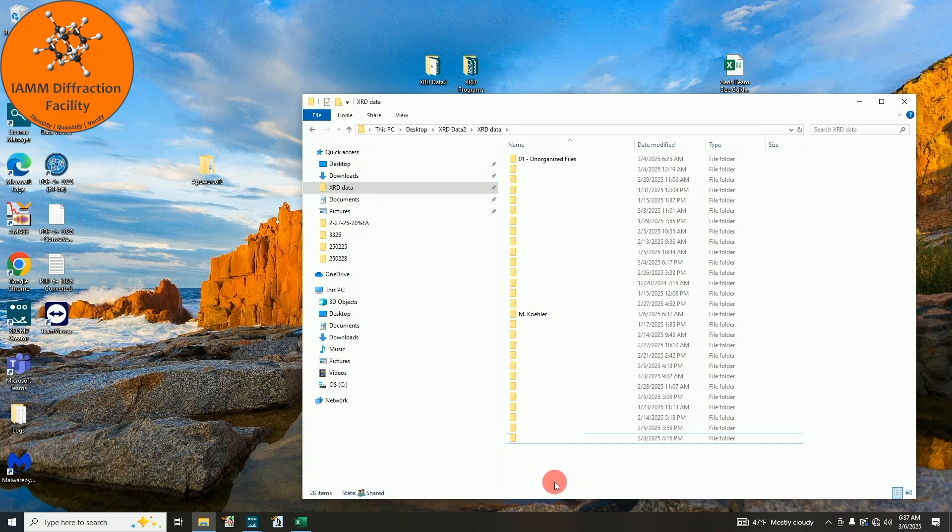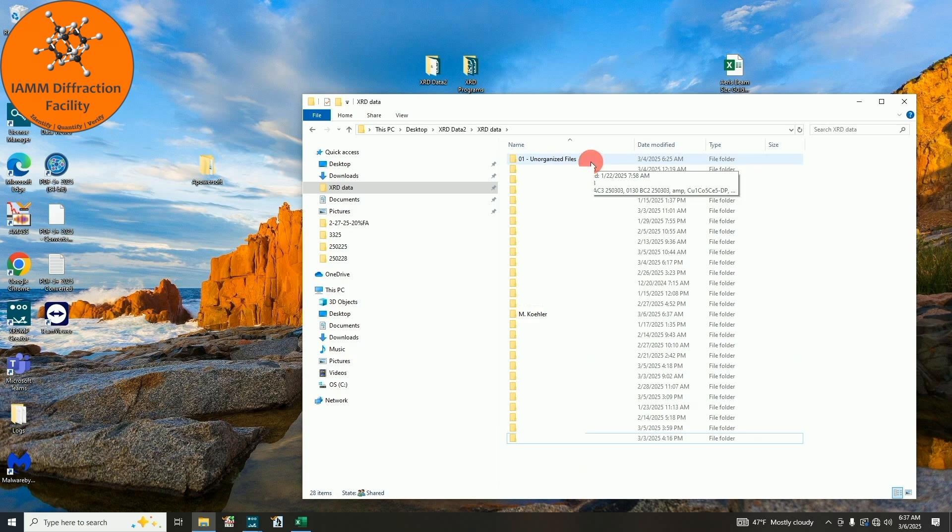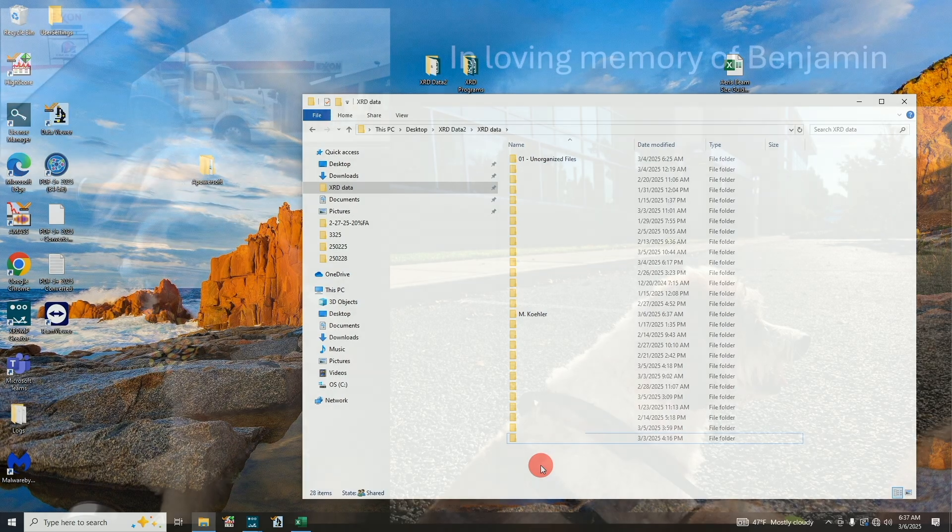If there are any of those files or any other files down here that haven't been organized yet, I will copy those up into this unorganized files folder at the top. So if you forget to copy your data and are looking for it, look up there.